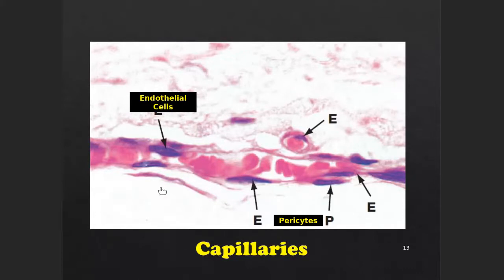Now these all are your capillary structures. See how it looks like. It consists of endothelial cells, flat endothelial cells. Then you will see these blood capillaries that are present over there, and then this is your pericyte. If you remember the word pericyte, which we used in the histology of capillary, it consists of endothelial cells, and the continuous type of capillaries have a pericyte. So this is a cell, they have a pericyte.